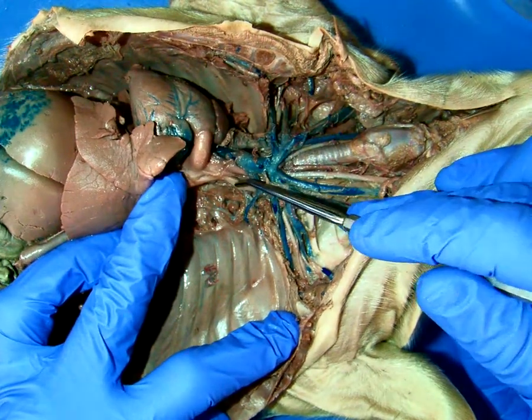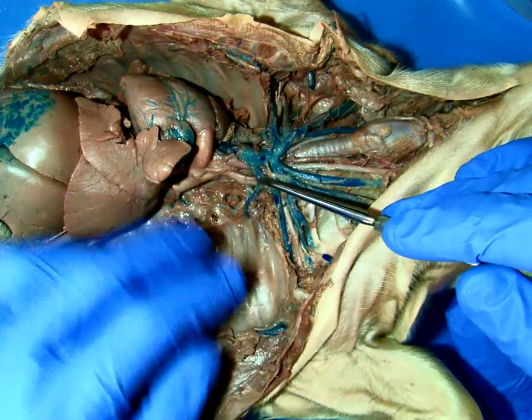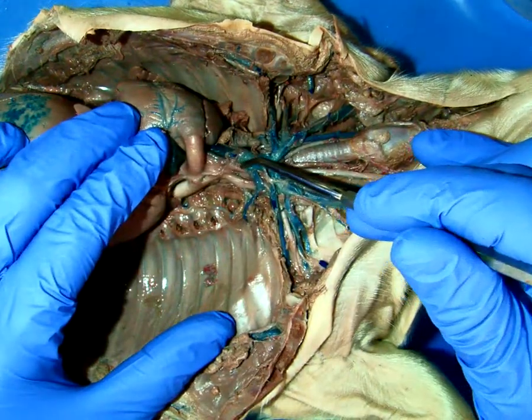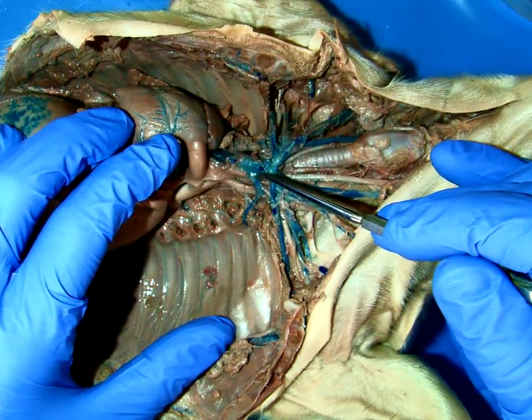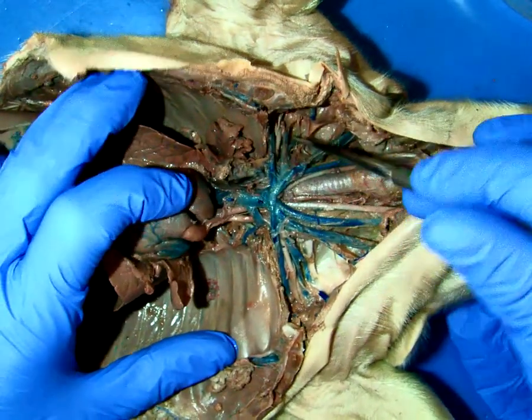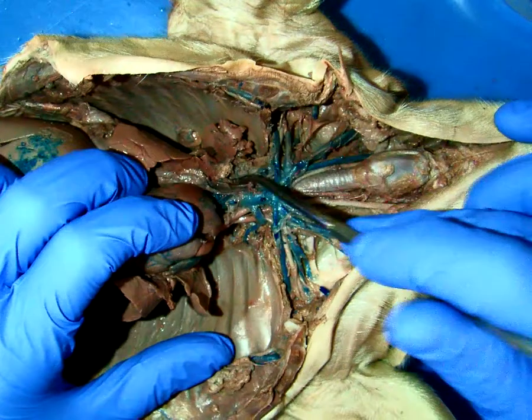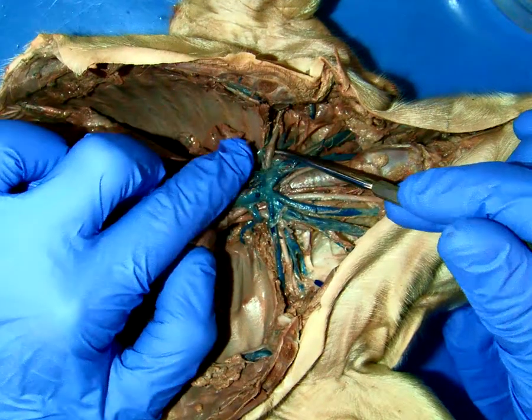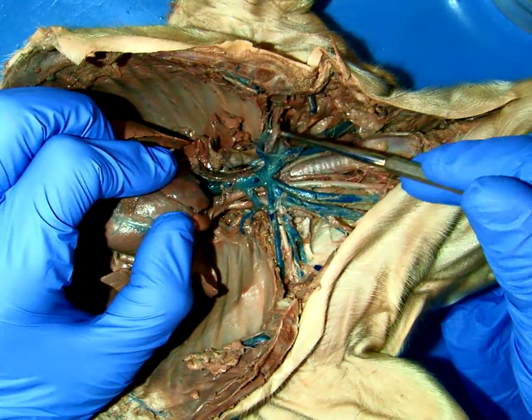All right, so it looks like it came from here, moved under the vein, and is moving along here. The other branch off the aorta, the brachiocephalic, is going to continue underneath these vessels. I don't want to move them, overstretch them, and break them, but it continues underneath these and branches. And it appears to give rise, about right here, to a right subclavian. I believe that's the right subclavian. If I move the veins and the nerves aside, this vessel is probably the right subclavian. It probably branched somewhere in here, and then continued on as the right subclavian.